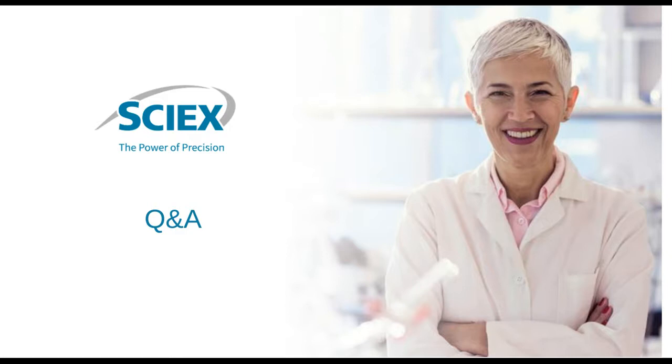So the first question then, with CZE UV, do you use bare fused silica or coated capillary? And if coated, what kind of coat? Can you comment on the buffer system and the stability of the capillary, please? So thanks for the question. The CZE kit uses a bare fused silica capillary, although you can use a neutral coated capillary if you would like.